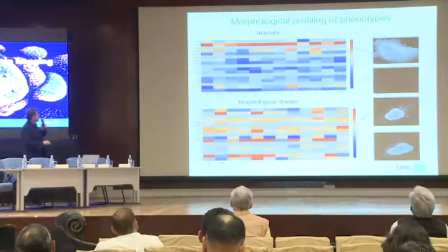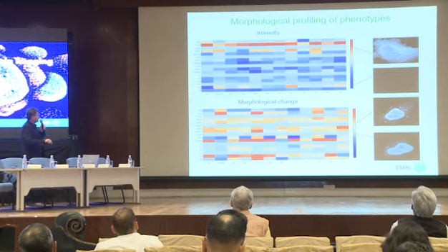Slightly problematic is that the distance between this one and this one is the same from the center of gravity, but there is a different angle. And so we have also, in our quantification, now introduced the angle between the two relative to a certain reference, and are then able to cluster, like it's shown over here. This is only the intensity profile, different treatments of the cells with the different markers that we're using, and we see in a quantitative manner how these morphological changes do, clustering morphologically and morphological profiling these phenotypes.